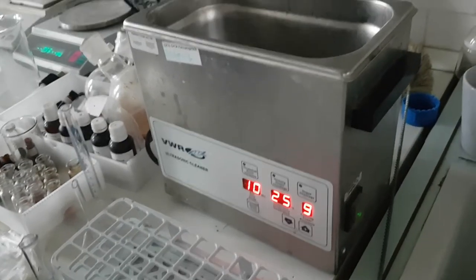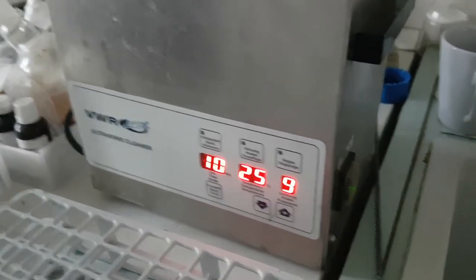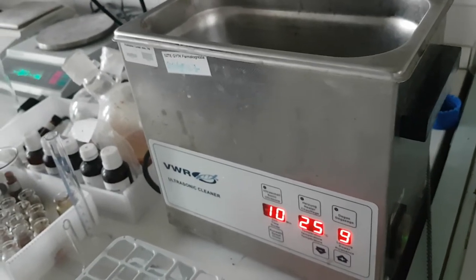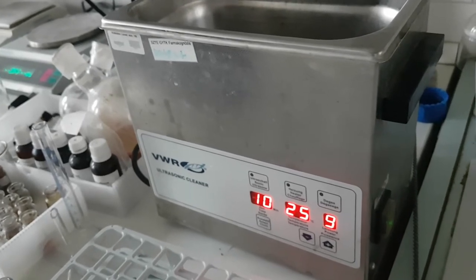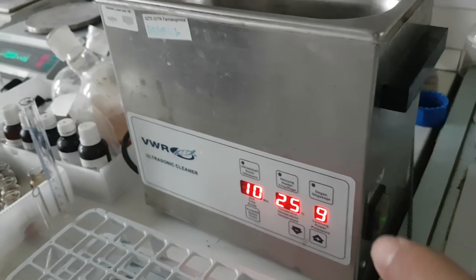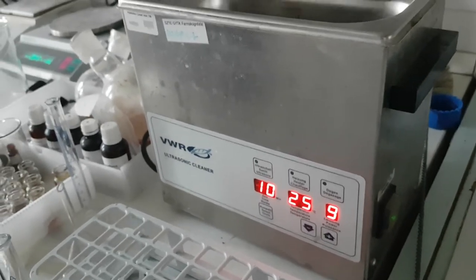We are using ultrasonic sonication to make an extraction — it is better than the Soxhlet apparatus. The Soxhlet apparatus is efficient and gives a good yield quickly, but it requires high temperature. When we use ultrasound, we don't need high temperature; we only have waves.